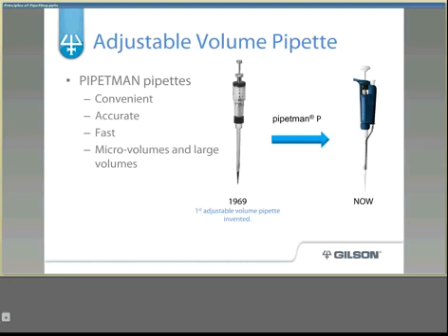The final evolution in pipettes are adjustable volume pipettes, invented by Dr. Warren Gilson in 1969. These are very important not only because they are accurate, but they also allow the technician to aspirate the exact volume they want. Pipetman pipettes are convenient, accurate, fast, and can pipette micro volumes of liquids all the way up to milliliters.